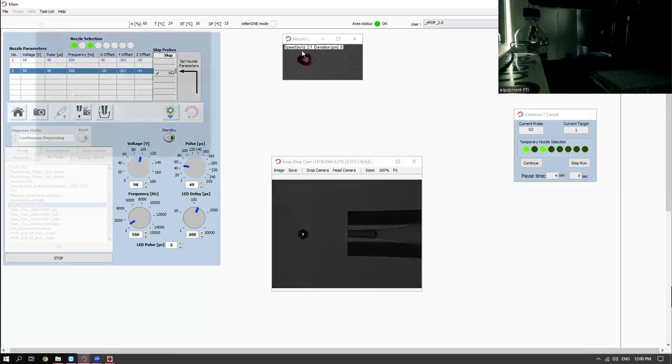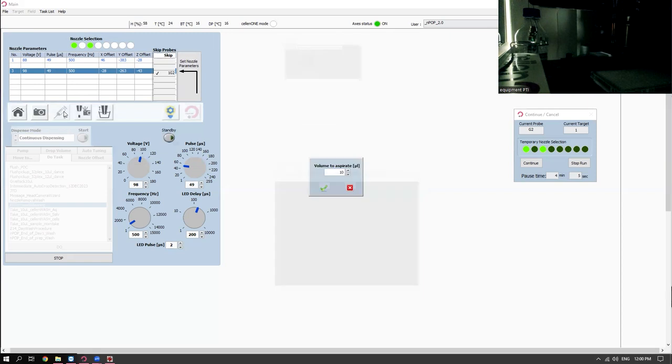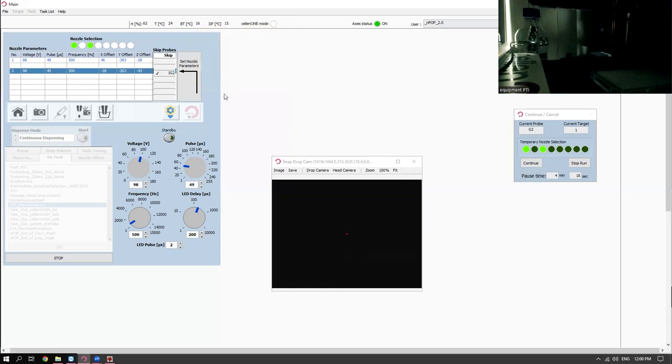Checking the droplets of the two nozzles. The nozzle's good. We're going to go and take up gene 2, take up 10 microliters. Okay, you loaded 30 microliters in those wells? I loaded 20. We usually load 20. Did you take up 30? No, I was taking up 10. Oh, 10's fine. But I already took up 10. Let's see what we shall see.